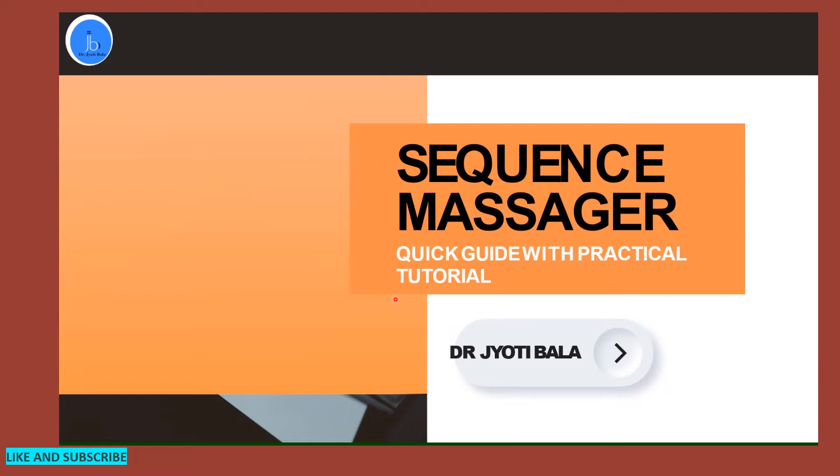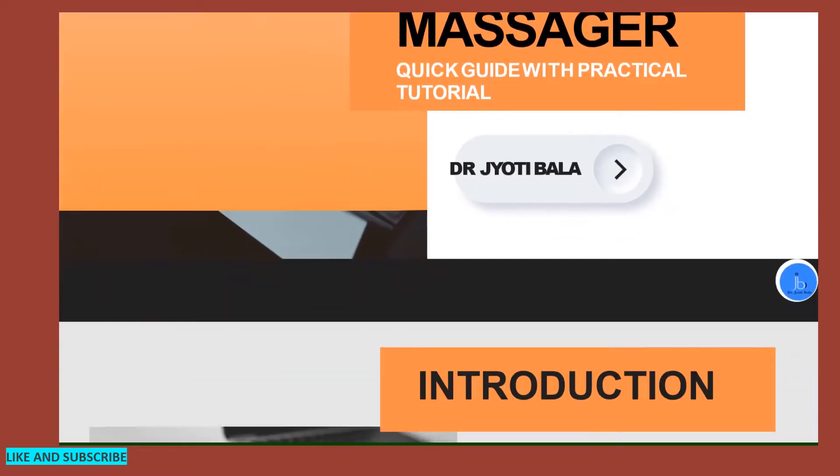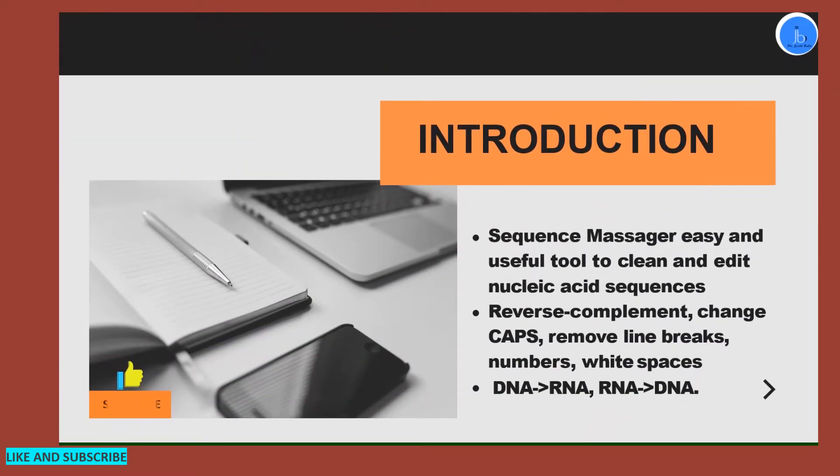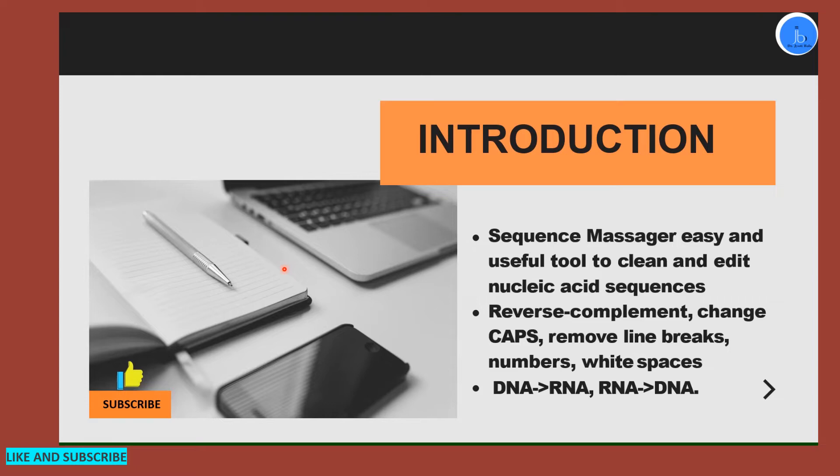I will be doing a practical demo as well, so let's get started with this quick guided tutorial. Sequence Massager is very simple yet quite useful for many daily lab purposes, both in wet lab and dry lab, as in biology, especially molecular biology, biotech, genetics, and bioinformatics.